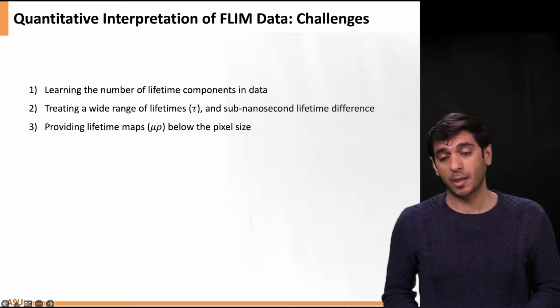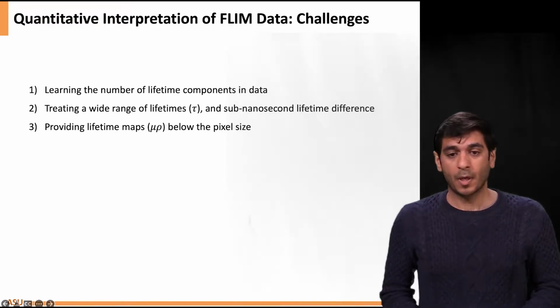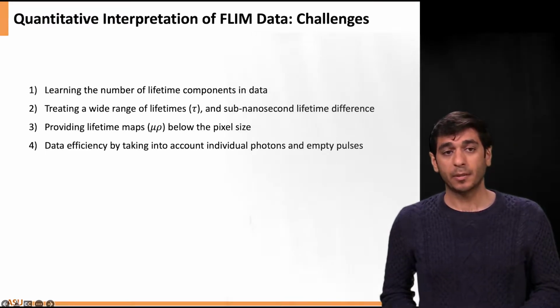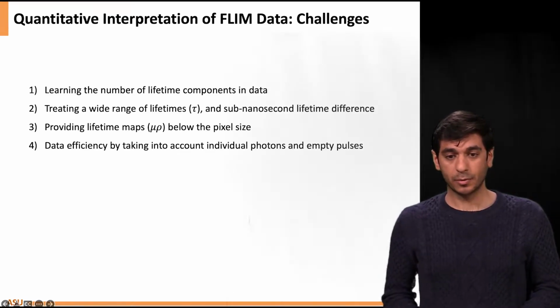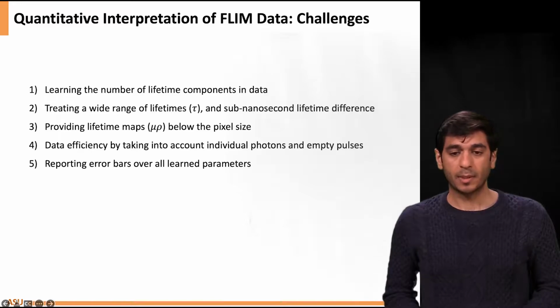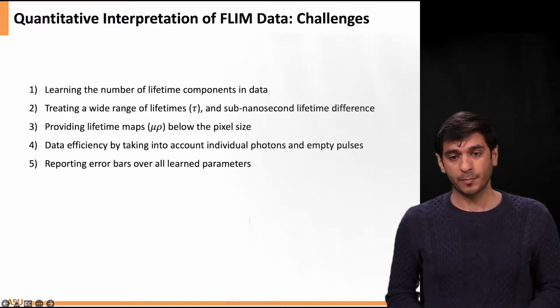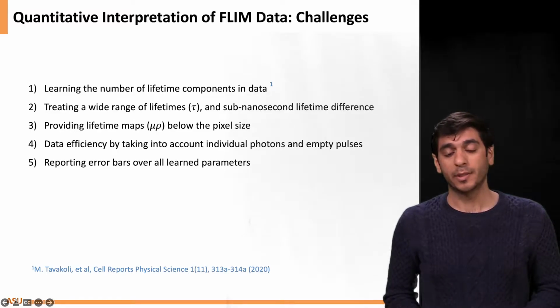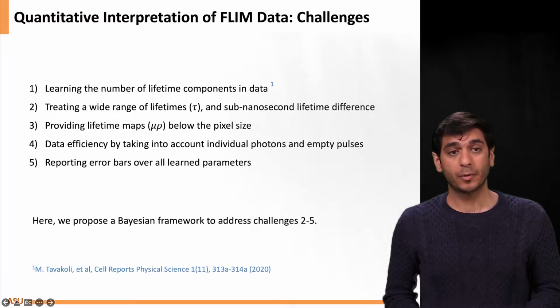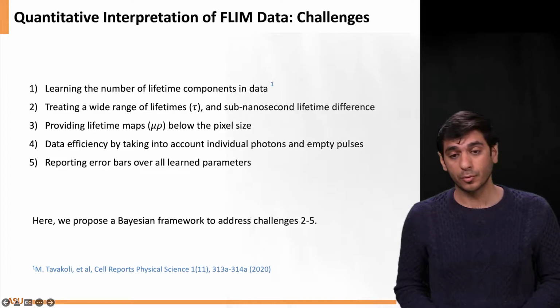The current FLIM data analysis techniques are limited to pixel size. The other issue is data inefficiency. Some of the existing methods bin the data, which causes losing a lot of information, and they also don't use information from empty pulses. And the last issue is reporting uncertainties over all the learned parameters. In a previous work, we addressed issue 1, learning the number of lifetime components for a single pixel. In this paper, we are going to address issues 2 to 5.